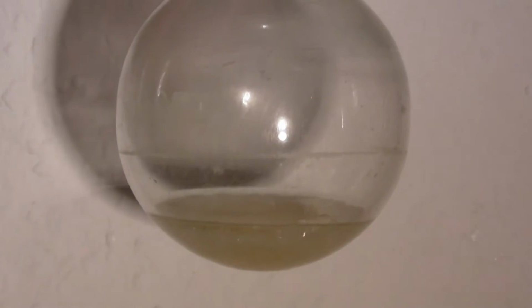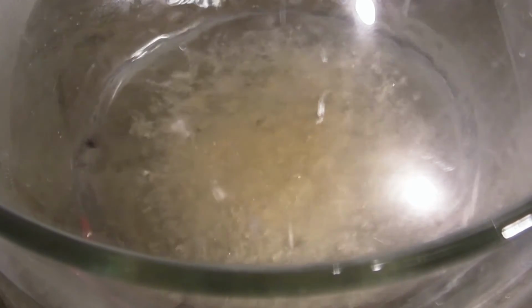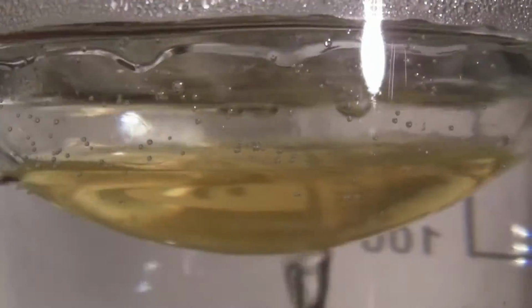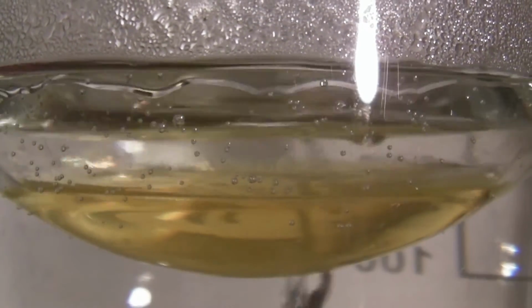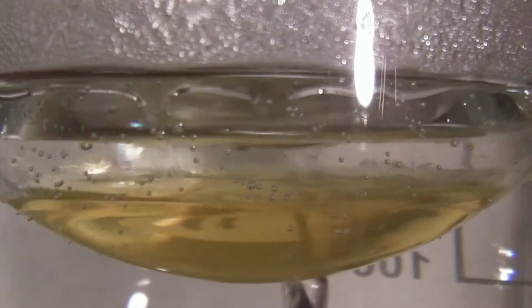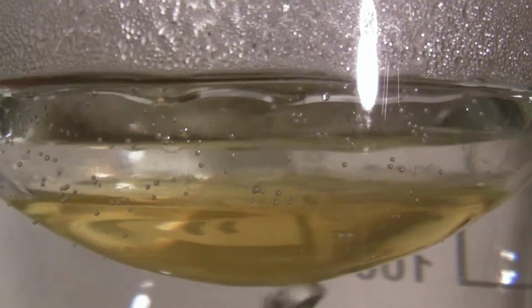After cooling down, the crystals still had a strong yellowish color and were square-like, so it was recrystallized again. The excess solvent was removed and the wet substance was heated again. Then it dissolved completely. Benzhydrol has a quite low solubility in cold petroleum ether, so the amount of solvent can be increased without any problem. This leads to a cleaner product with a slightly higher loss.